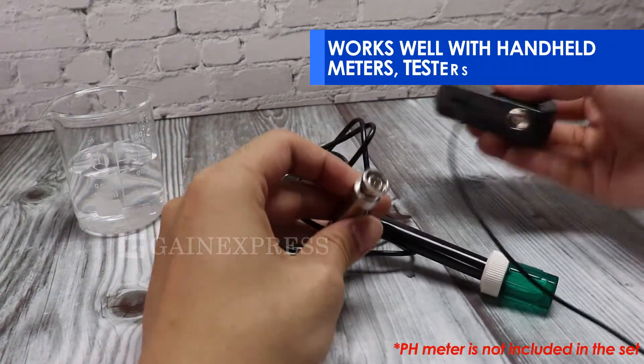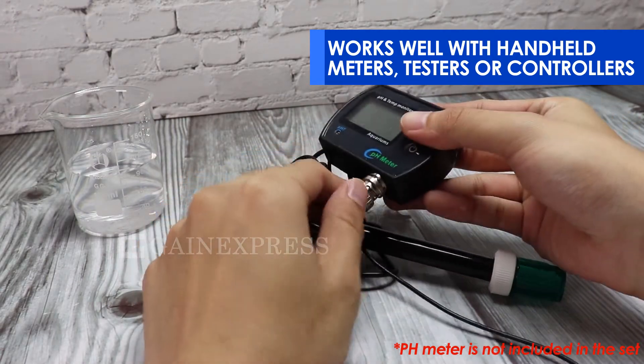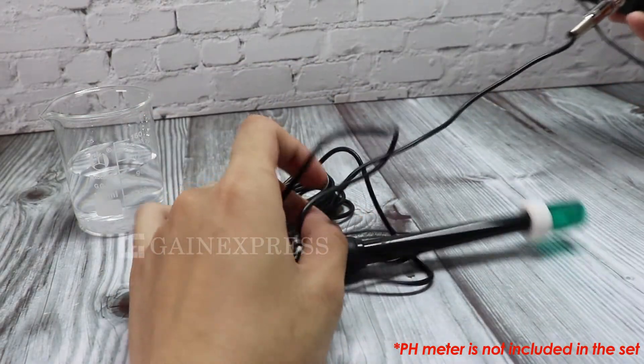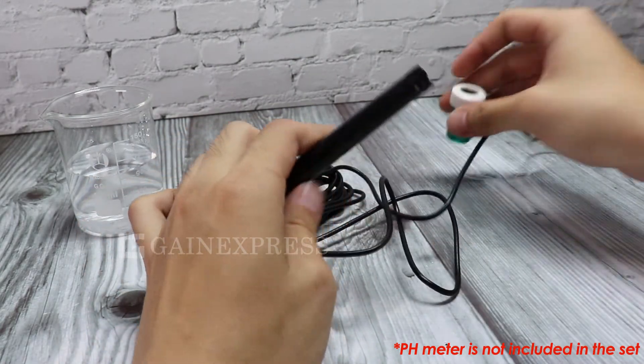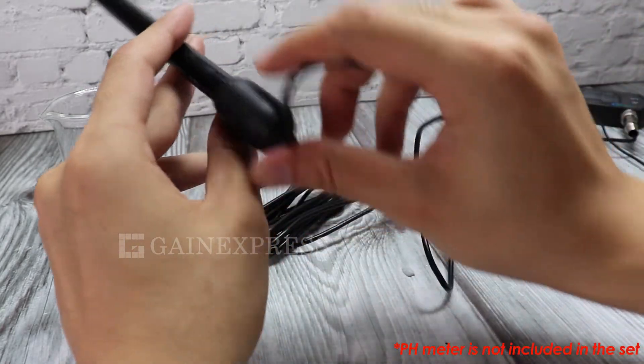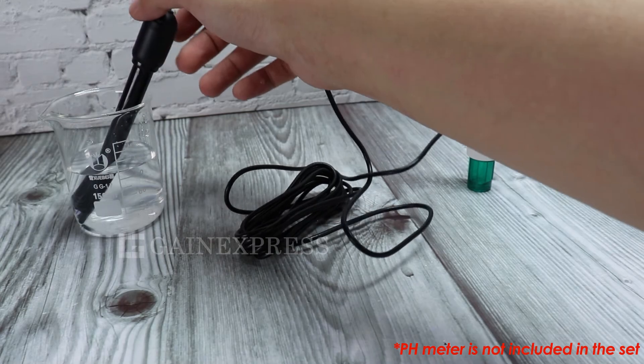Works well with handheld meters, testers, or controllers. Many users, such as those in clean water treatment, pool and spa water testing, have their needs met with testers, meters, or controllers that have replaceable PH electrodes.